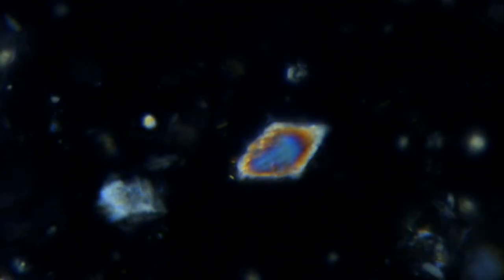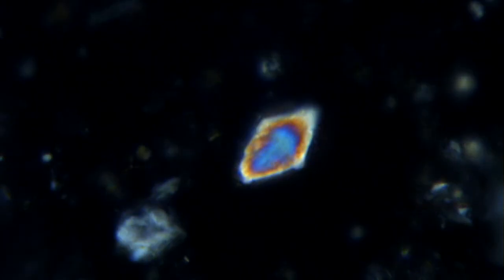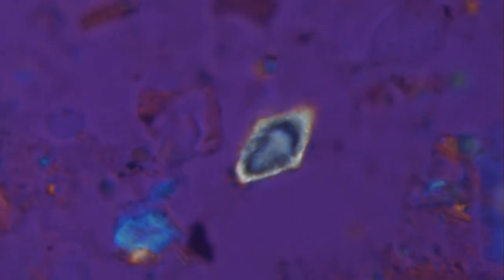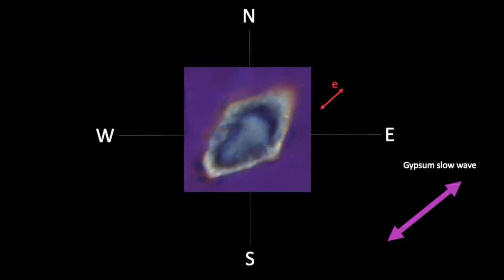This time I selected one of the elements of the Ascidian spicules I mentioned earlier. As I mentioned several times, these are made of aragonite, which is biaxial, but also negative, so the same rules for the gypsum plate apply. In this position, retardation subtracts, so it's the faster extraordinary ray that is aligned northeast-southwest.